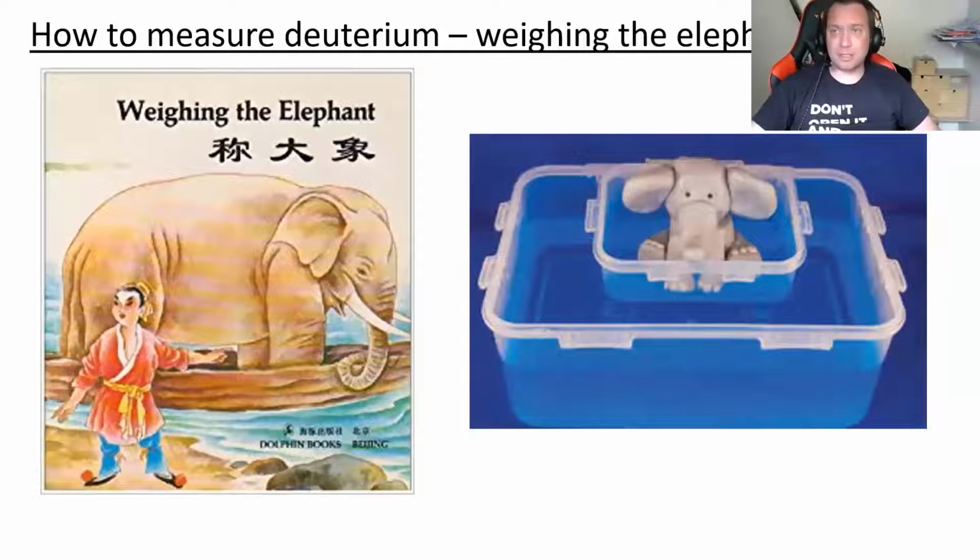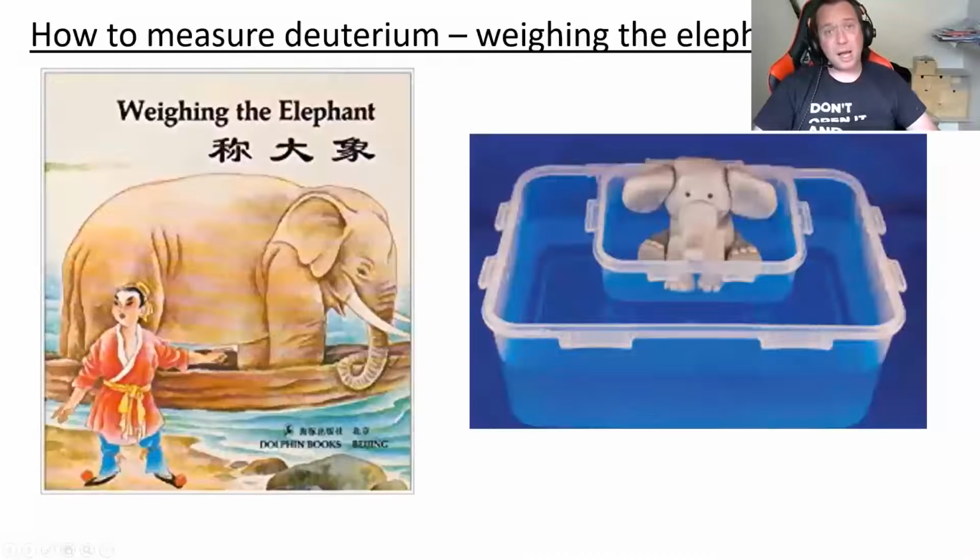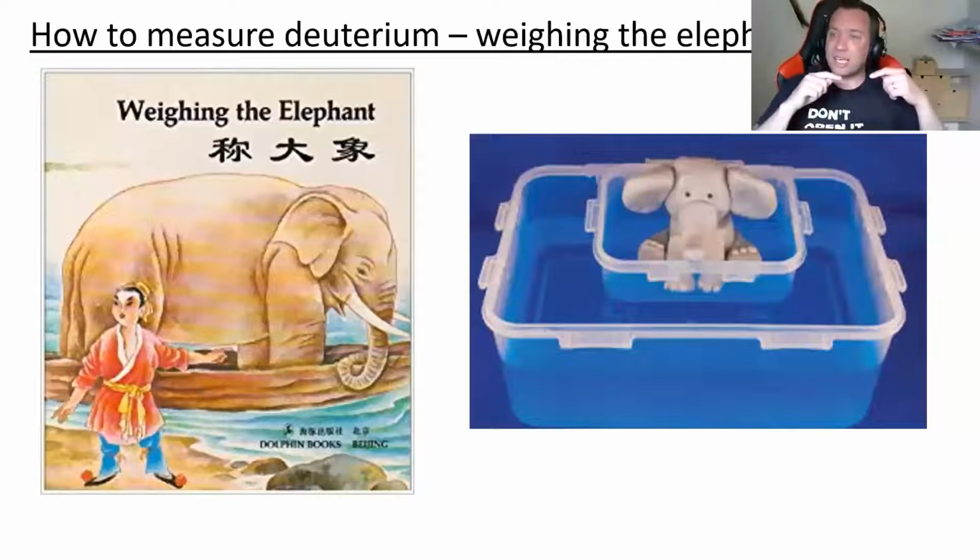So you need to actually measure the concentration of the deuterium in the blood. Now, you can measure the amount of deuterium using isotope ratio mass spectrometers, but these tend to require really quite large amounts of serum. They're mostly set up for doing human work, so I'm not going to talk about those. But you do not often get 400 microliters of serum from a mouse that you can readily use. So I'm going to talk about a method which we got from Stephen Previs's lab. He was very helpful with it, and this reference here I'm just going to mention to you because it's really good. And the way it works is by an indirect way of measuring deuterium.